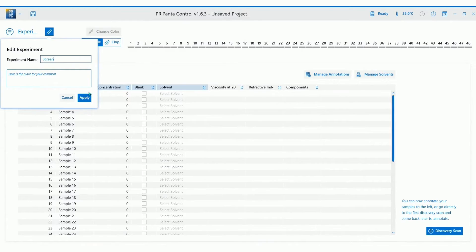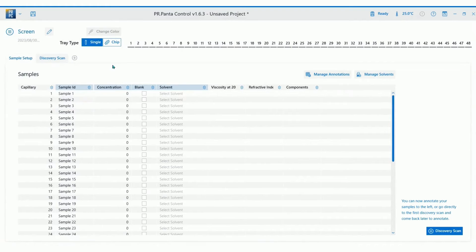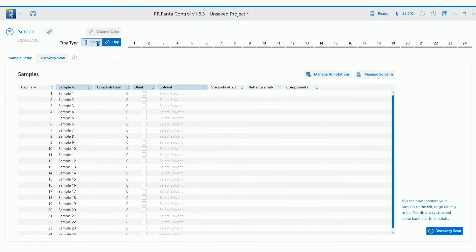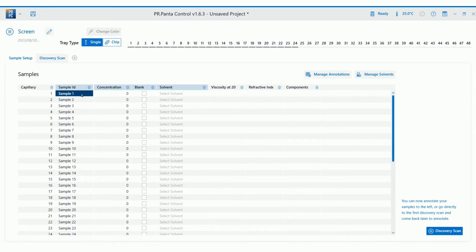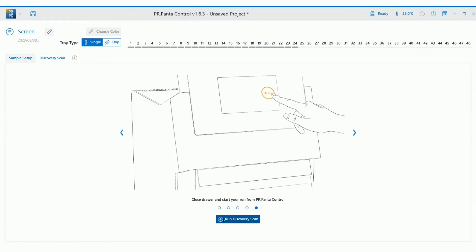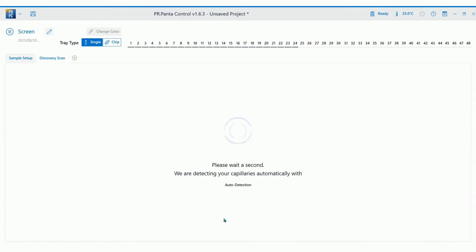Then name your experiment and select the tray type, single or chip, depending on the format you want for loading your samples. You have the option to annotate the samples now or go directly to discovery scan and come back later to finish annotation.